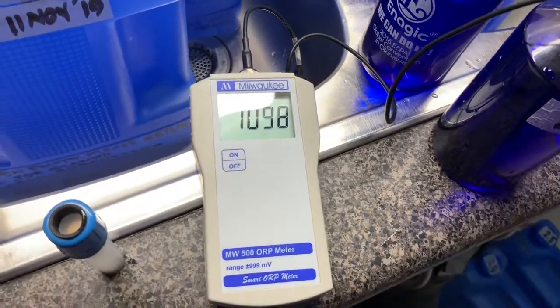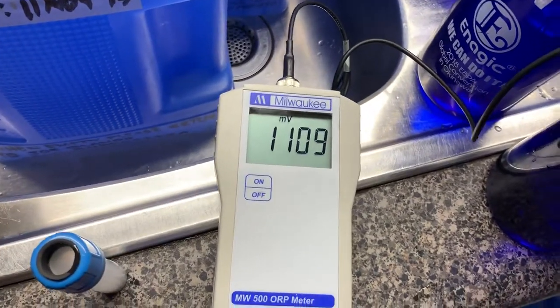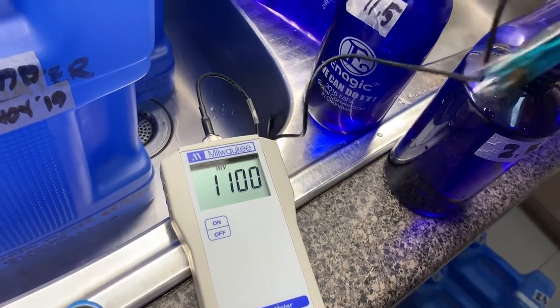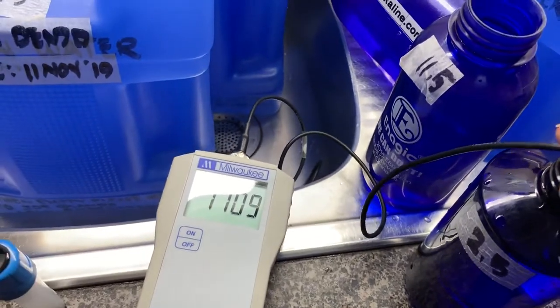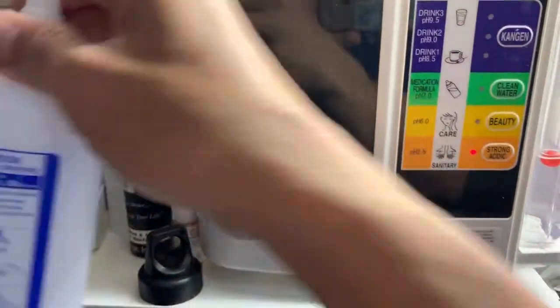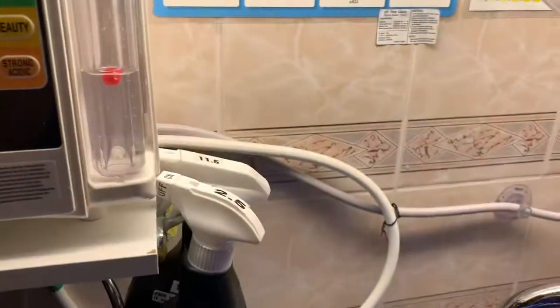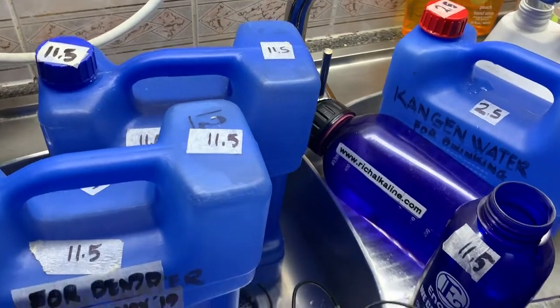Good day everyone. Today I'm going to show you how to condition your Milwaukee ORP meter. You can see I've got an ORP meter here and this is the testing rod — I've been soaking it in 2.5. Now make sure you make fresh 11.5 and fresh 2.5 when you make them from your SD 501. Make sure you've got the electrolysis enhancer in there — if it's empty you're not going to make a strong 11.5. That's the key on conditioning your testing rod.